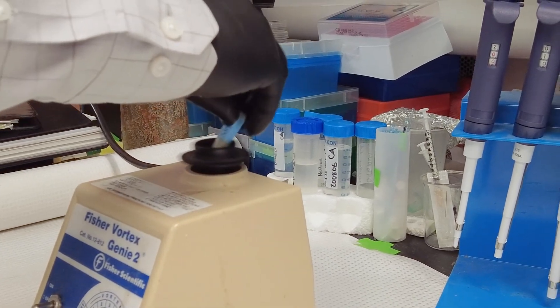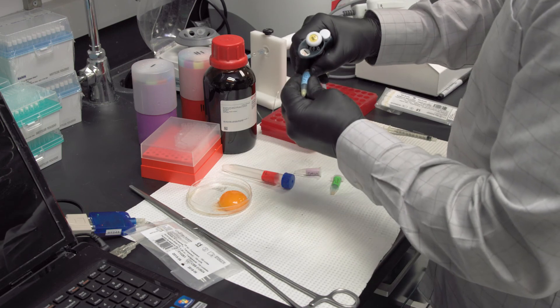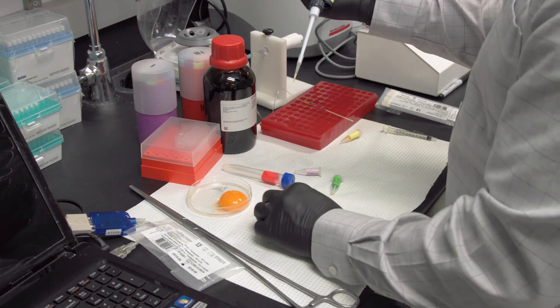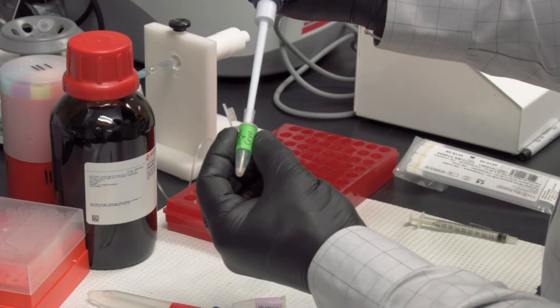The cryopreservation solution is then mixed with fresh semen in a ratio of 3-part semen to 2-parts cryosolution. The solution is slowly added to the semen while gently mixing.